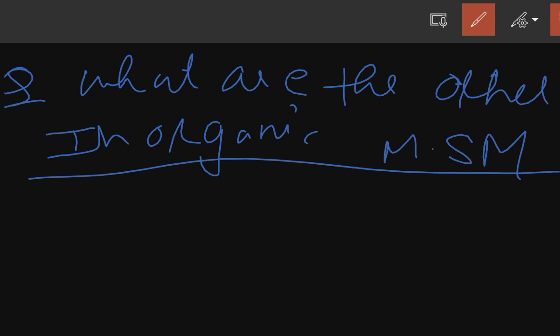Now let us understand the next question that can be asked in the interview. From the interview point of view, they can ask you what you understand by elemental analysis. You must be aware of elemental analysis and how it is used in different industries. This question is widely, or frequently, asked in examinations. We have already discussed that it is a method used for qualitative as well as quantitative analysis.